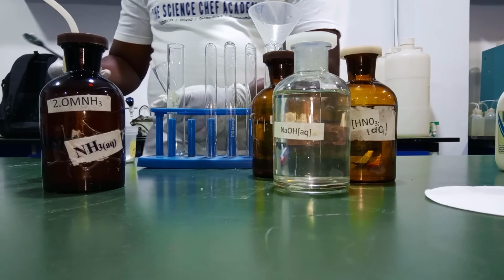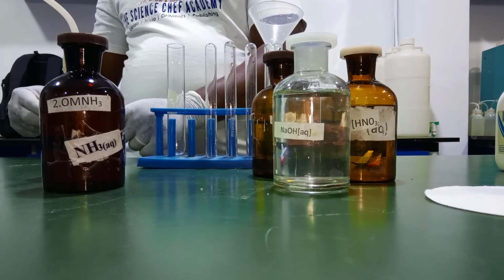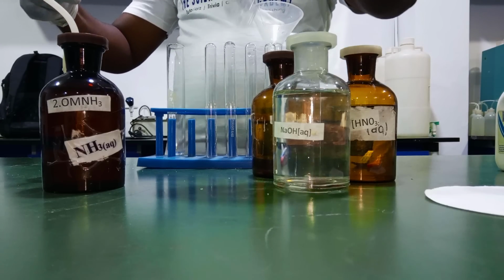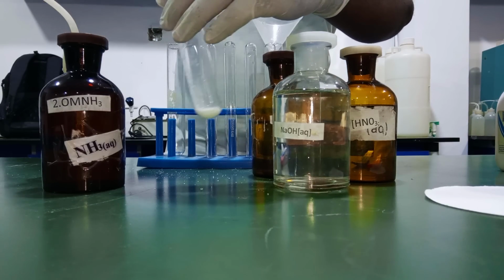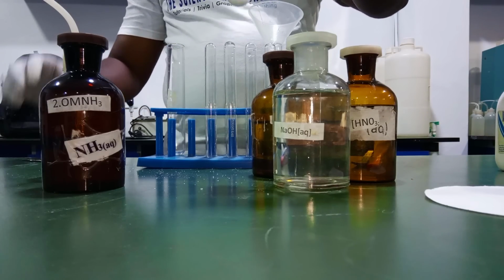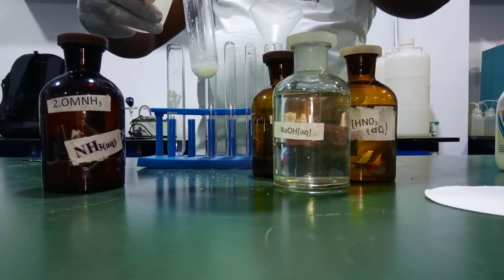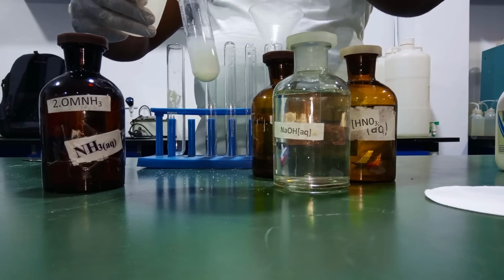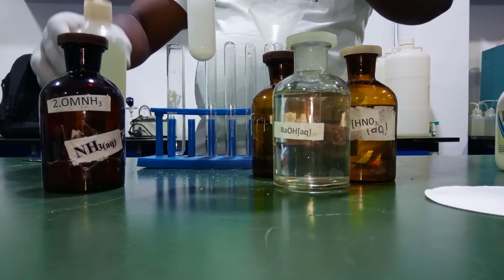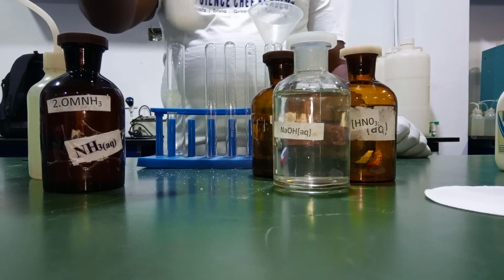We're going to take a spatula full of a sample and add it to the boiling tube, and then we add distilled water to dissolve it.